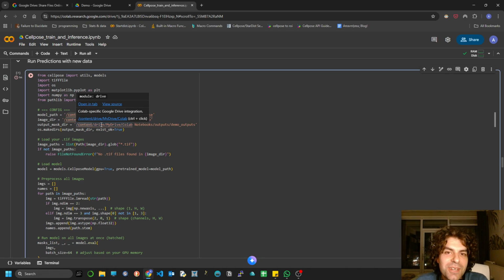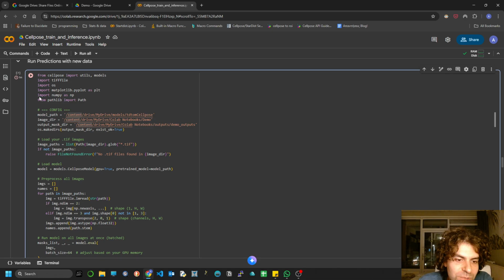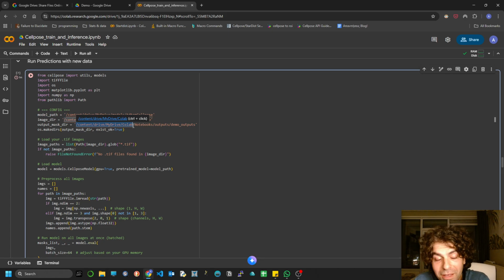So let's do it outside, and it will be much faster, trust me. You don't have to have this folder created already. It will be created once you run this cell. Just make sure that the path makes sense and it originates from the same parent paths, right? Otherwise you won't create anything anywhere, I suppose.